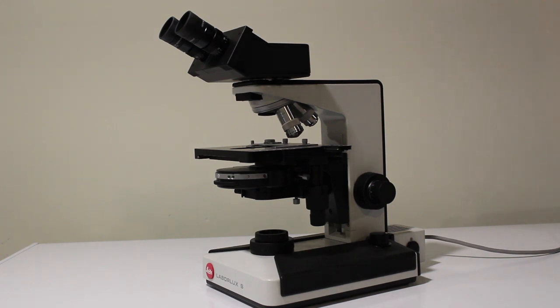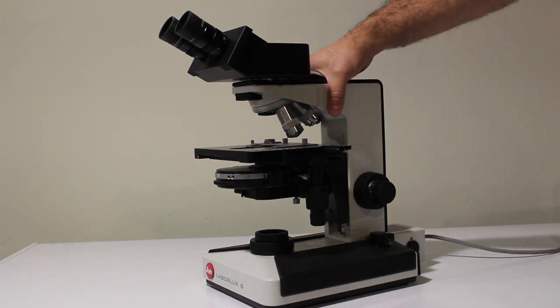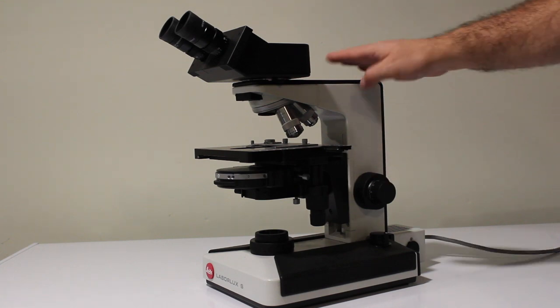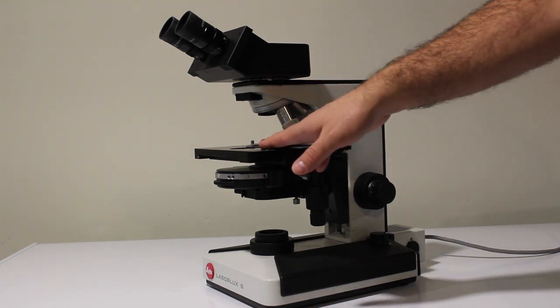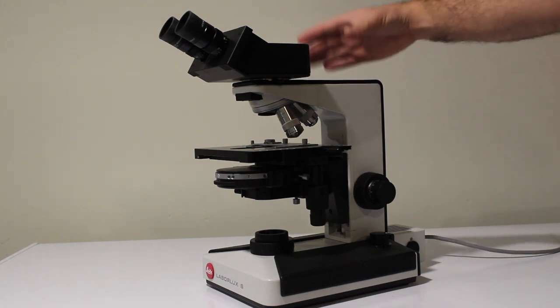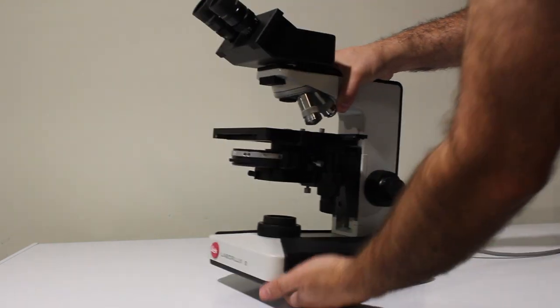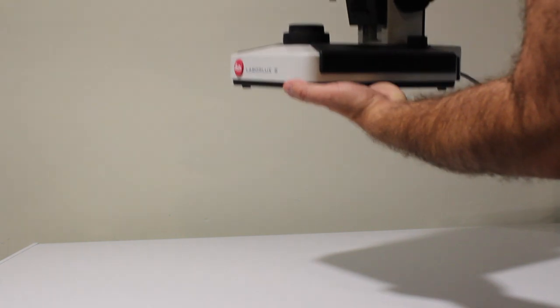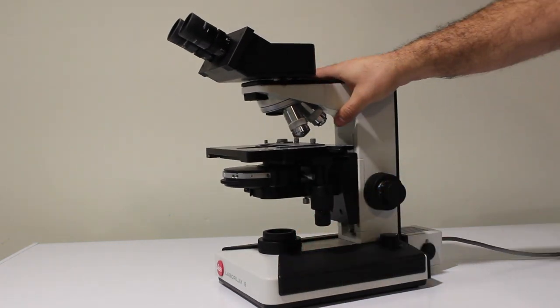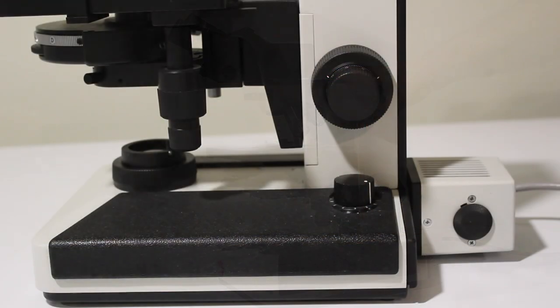Now, one of the first things that you need to consider whenever you are handling a microscope is how to move it. And what you don't want to do is pick it up by the armature. This armature is really important because it's what keeps the optics aligned with the light source and with your sample. And so if you were to bend that, you would ruin your microscope. What you want to do instead is always lift from the base, using the armature simply to support the microscope and keep it from tipping over.